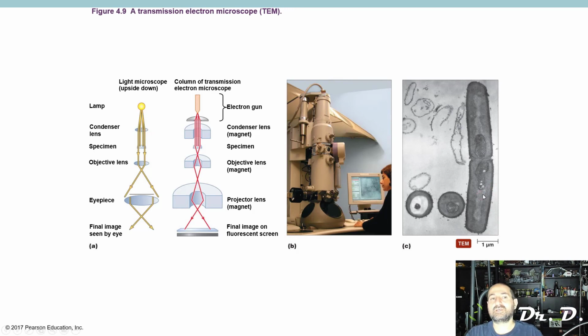And by the way, with transmission electron microscopy, you have to section first. Again, you dehydrate, you stain with heavy metal, and you have to section the samples, right? So you can't see a whole bacteria, but you could slice the bacteria into really, really thin micrometer sections, right? Really tiny sections.